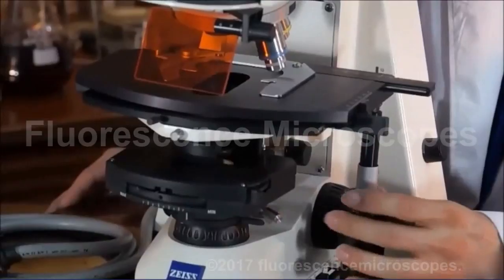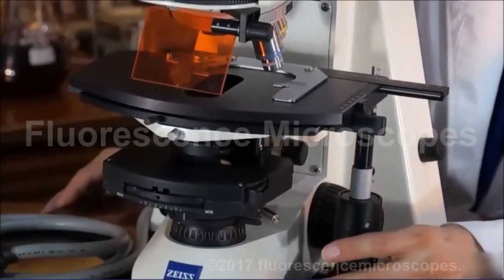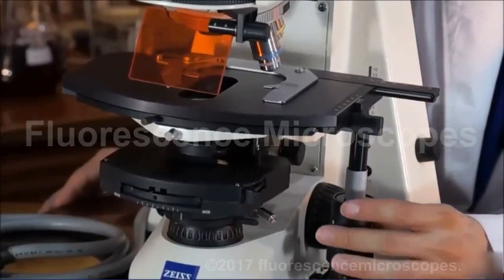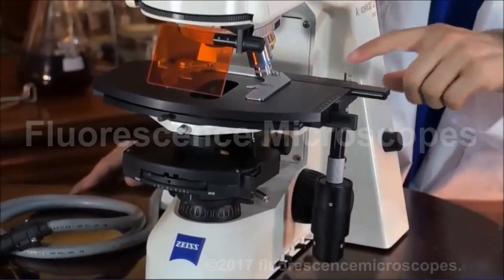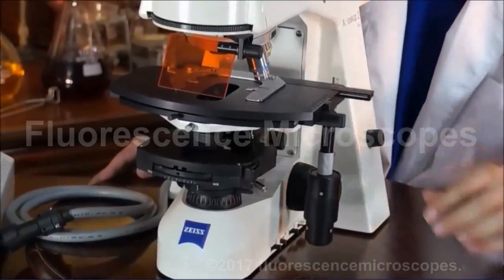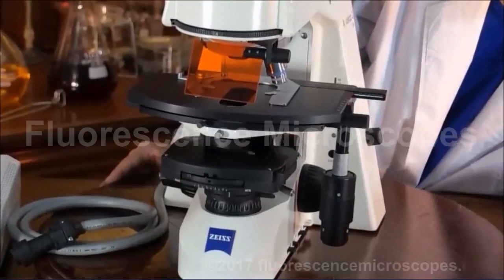This is the right hand stage with X and Y movement. You've got readouts on the top of the stage too to see the distances that you're traveling.